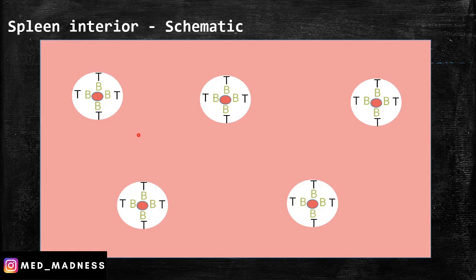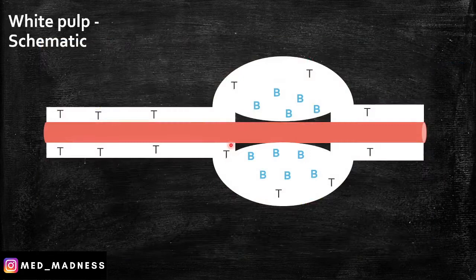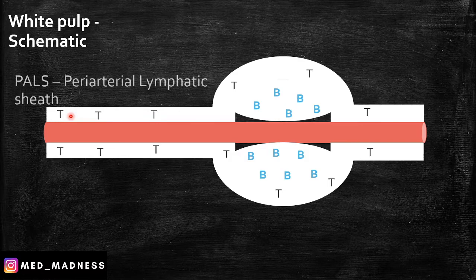So this is the spleen interior. You can appreciate the red areas here, which is the red pulp, and the white ones are the white pulp. Taking the white pulp — you can appreciate the splenic artery and arterioles here. This is surrounded by a sheath of T cells. This is nothing but the peri-arterial lymphatic sheath, or PALS.